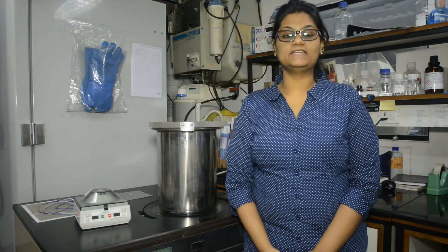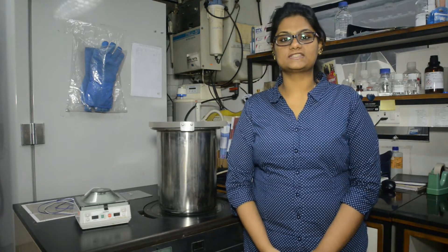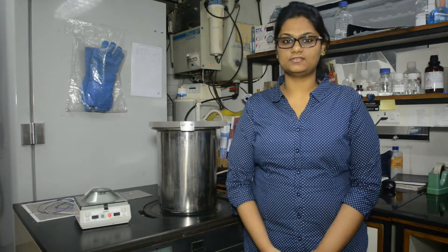Hello. A speed vac and a freeze dryer are commonly used instruments in a laboratory. Both instruments are used to evaporate solvent, often water, from a solution containing proteins with some salts.